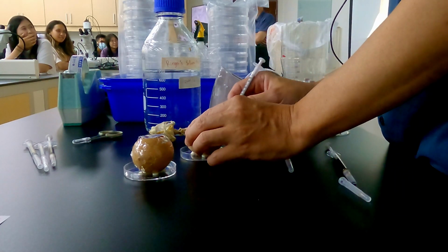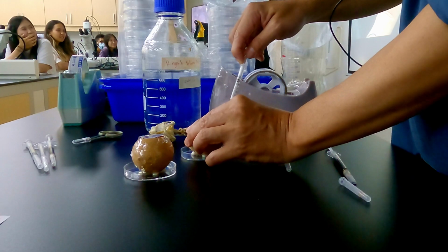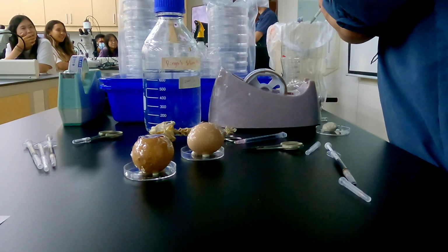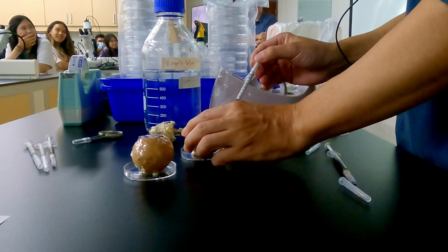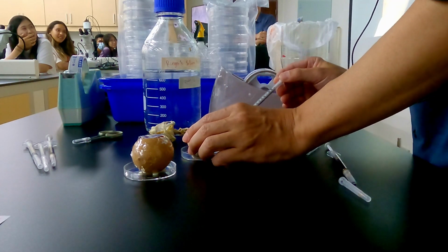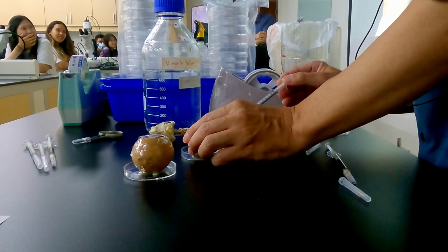So what's the big picture here? Why go through all this really meticulous work with a tiny chick embryo? Well, the main goal, as the guide lays it out, is to perform histological observation, looking closely at tissues or structures you can only see during development. Things that disappear later on.